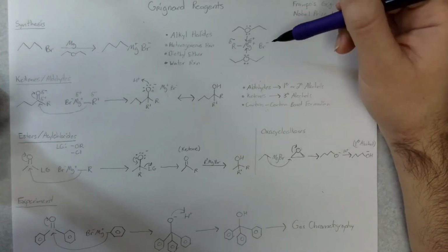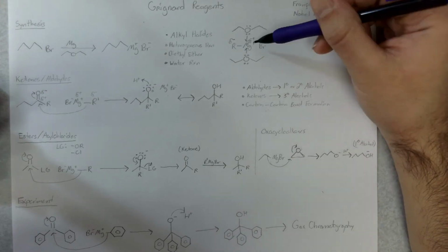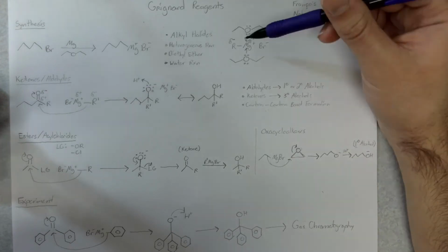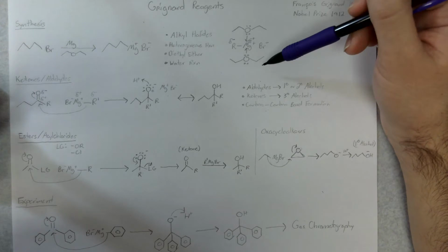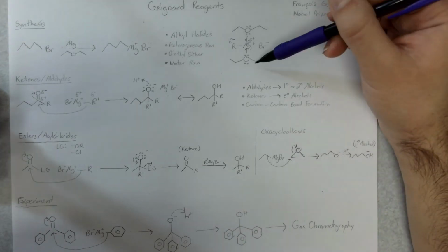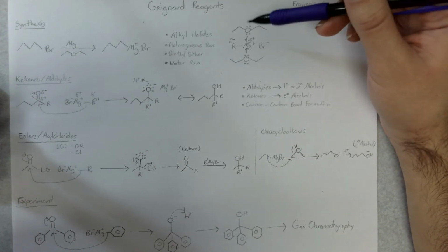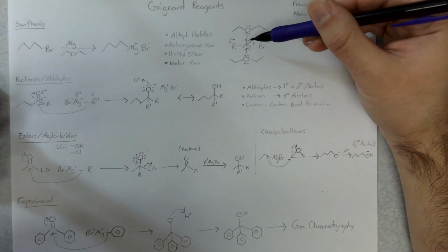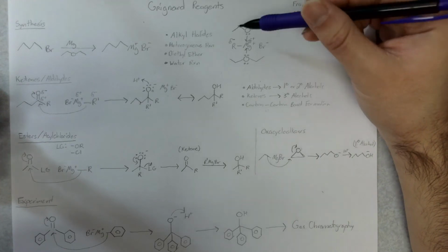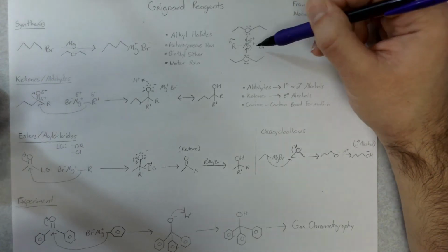And organic solvents tend to not dissolve very, very polar substances very well. But in this case, we're able to use diethyl ether or something else like tetrahydrofuran. So why is diethyl ether different? It's because it is able to coordinate with the magnesium in order to stabilize it. So right now, magnesium essentially has 4 pairs of electrons currently.